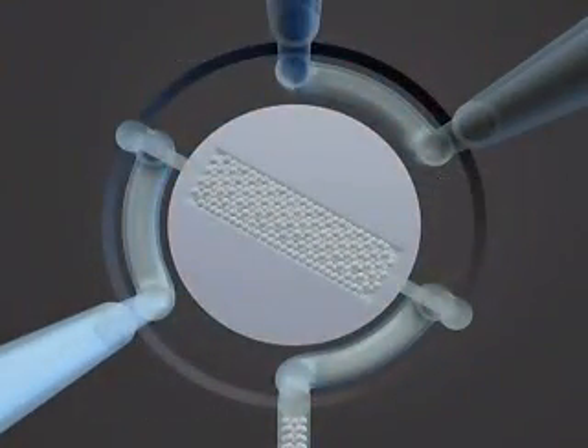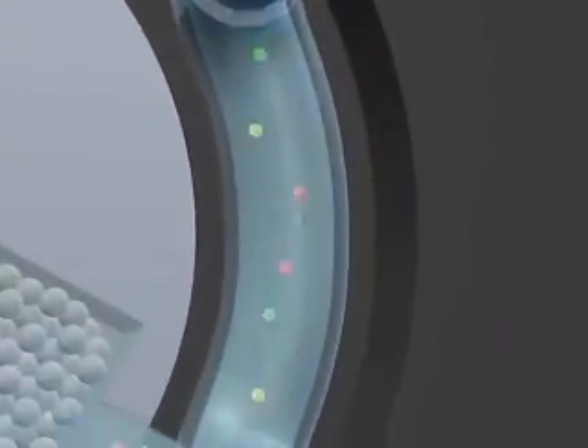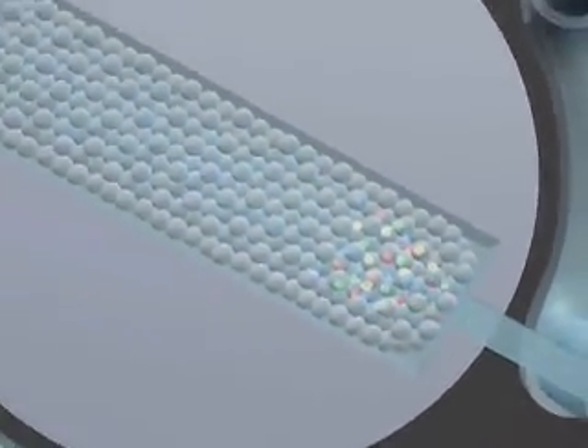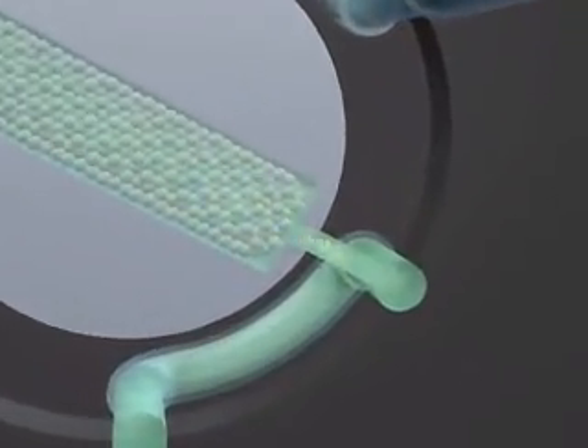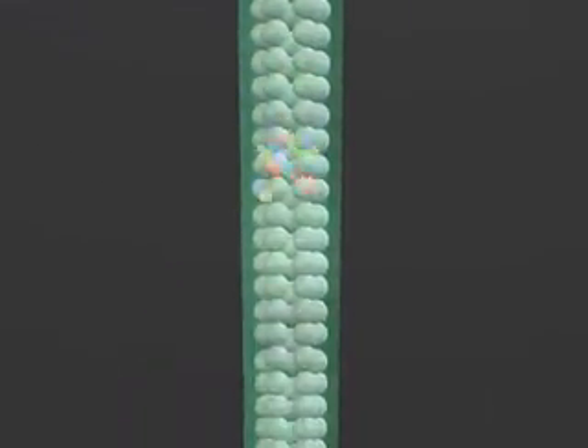Let's look at how the HPLC chip system can be applied to a typical protein identification analysis. The Agilent 1100 micro-auto sampler loads the digested proteins. The solvent flow moves the sample plug into the trapping column. The micro-valve changes the flow path. The gradient flow from the nano-flow pump takes the enriched sample from the trapping column to the separation column.